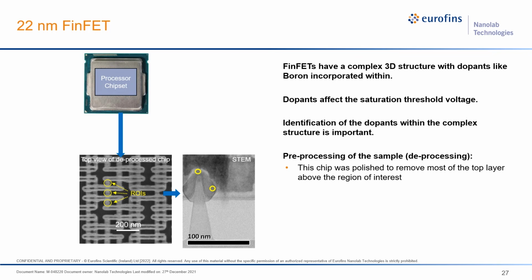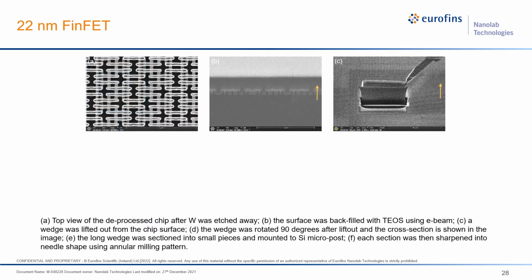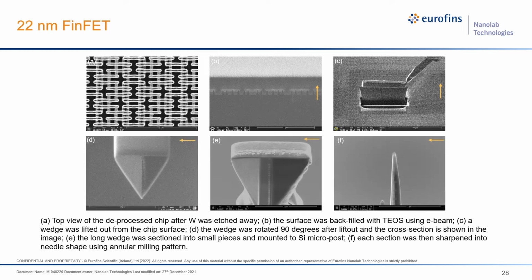And the second is to etch away the tungsten layer, because the tungsten evaporation field for the atom probe, compared to the evaporation fields of the other heterojunction layers in here, is so different that it affects the tip survival. We also make sure that the sample preparation happens uniquely here, and the sample is rotated 90 degrees, again to ensure better sample survival under the high evaporation field.